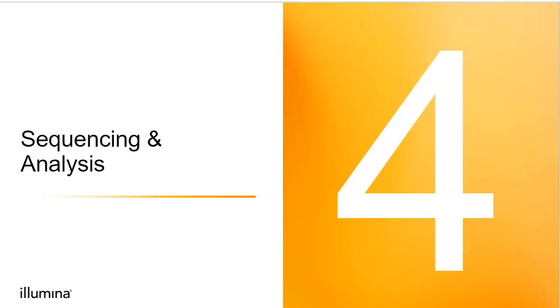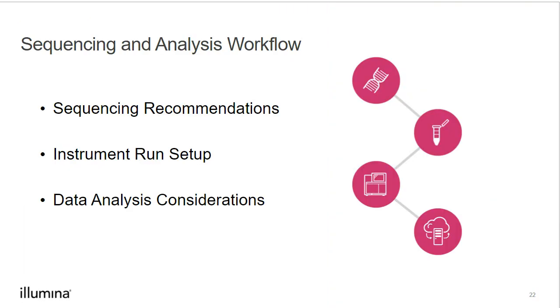So let's talk about sequencing and analysis options now. The general steps in the sequencing and analysis workflow that we'll touch on for Illumina RNA Prep with Enrichment are the sequencing recommendations, the instrument run setup options, and finally, data analysis considerations.